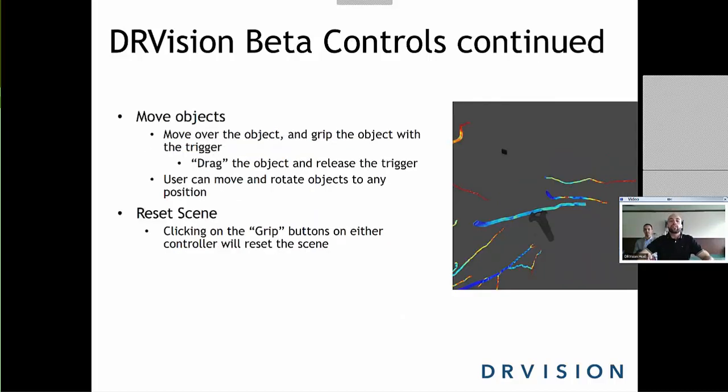And that's useful for moving up and down throughout the scene. So one thing that is in VR is just really intuitive is moving objects around. So here's the Vive controller. This is the D-pad I'm talking about right here, and the trigger for doing most of the animations. These are the infrared sensors that I mentioned before.